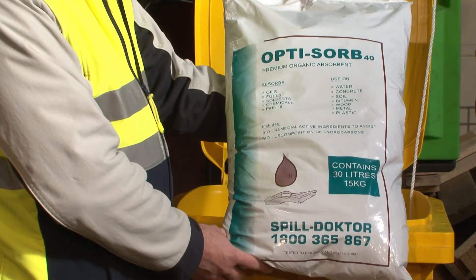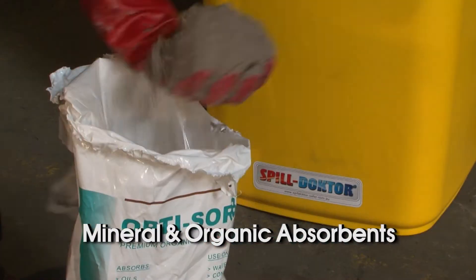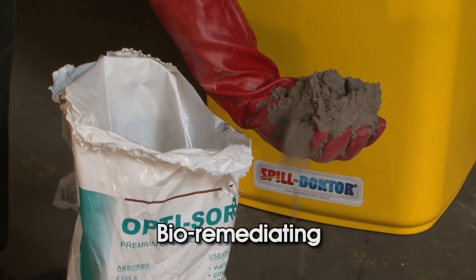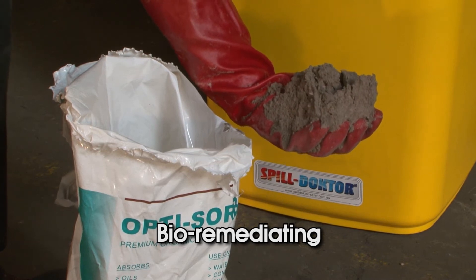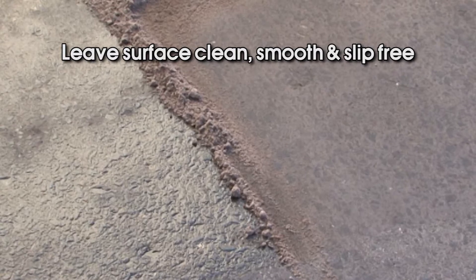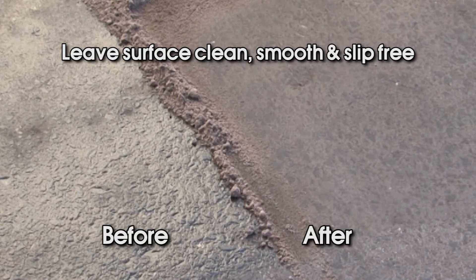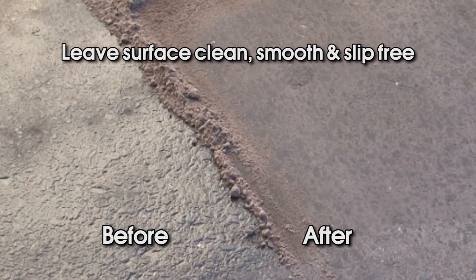Floor absorbents. The Spill Doctor Optisorb 40 is a proven effective and efficient floor absorbent. It contains both mineral and organic absorbents and contains naturally occurring oil-eating microbes which help break down oil waste. Optisorb 40 will absorb any remaining spill residue from the surface and, unlike other brands, will leave a smooth, clean and non-slip finish.